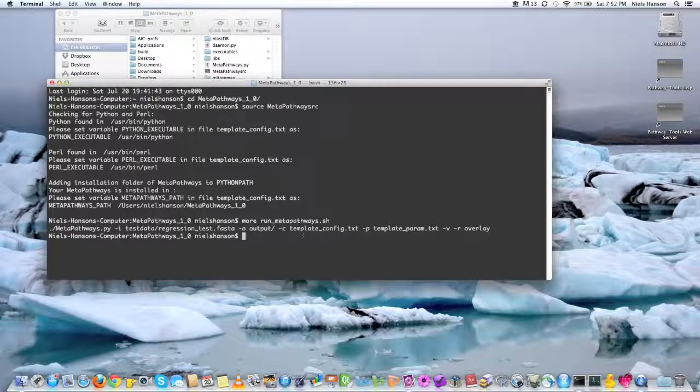As a case in point, we can just type this in.